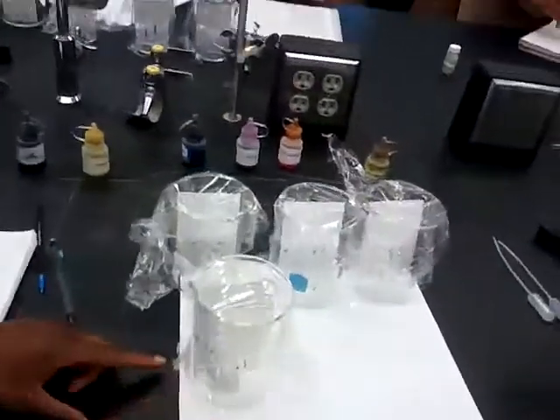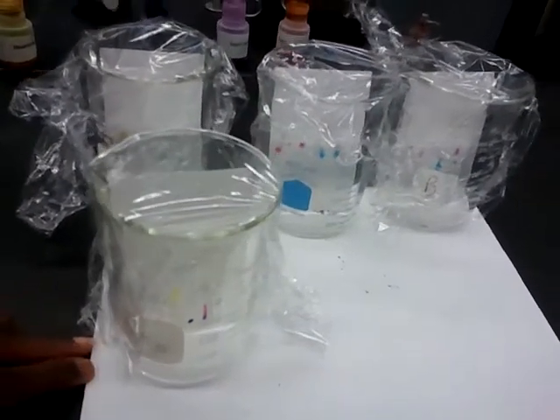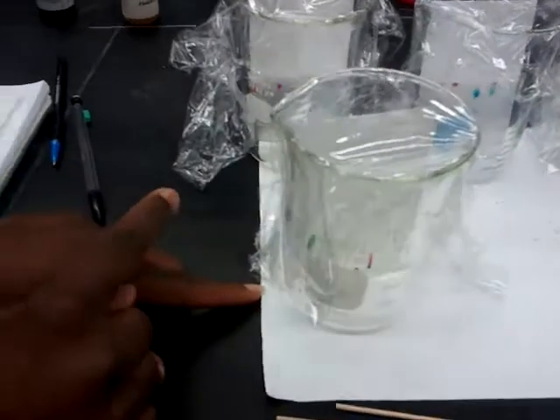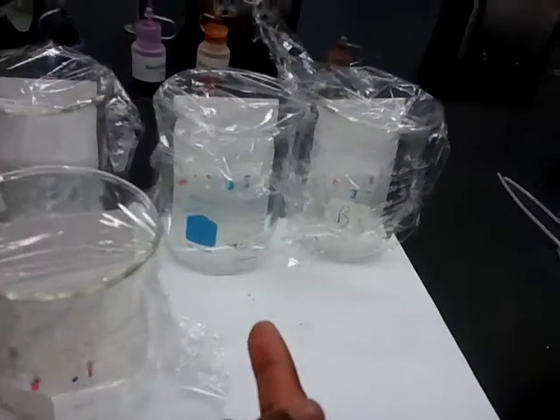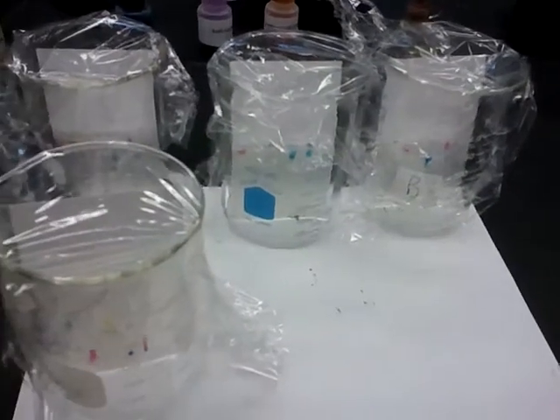So here today, let's look at these. We have different solvents, which is going to vary here, because we have water, we have the 15:2 ratio solvent, and we also have two 1:1:1 solvents. Those are actually your different variables.